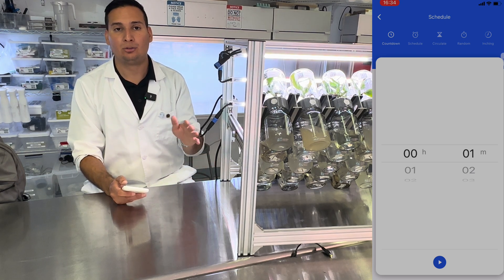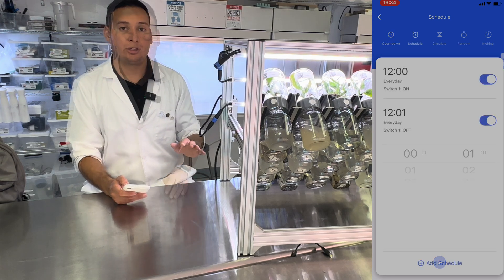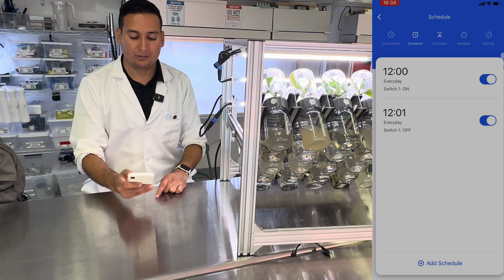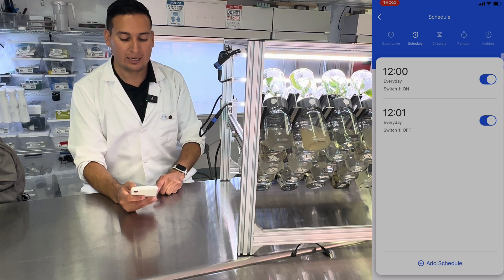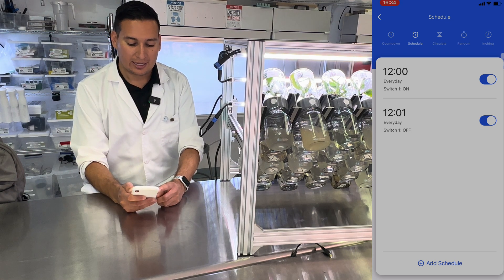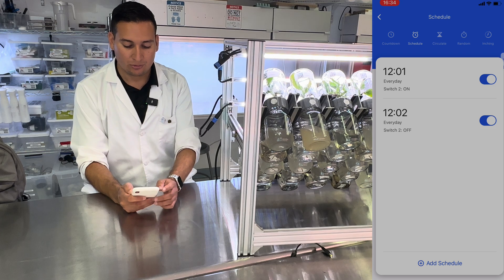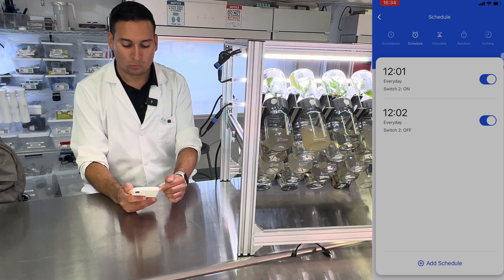It's important that you set up two timers, and make sure to turn it on and then turn it off after one minute. So if you want to flip the BioTil once a day for one minute, this is how your schedule should look: switch number one turns on at 12:00 and off at 12:01. Then switch number two turns on at 12:01 and off at 12:02.